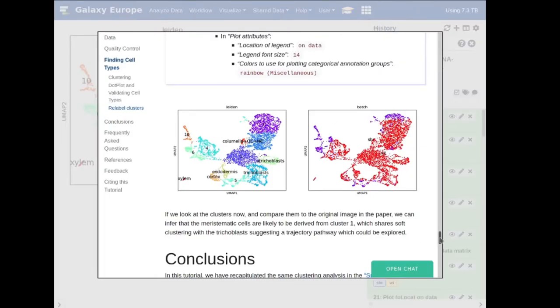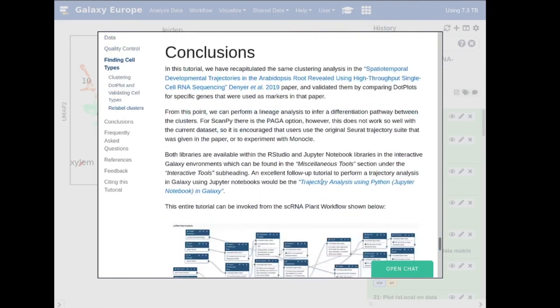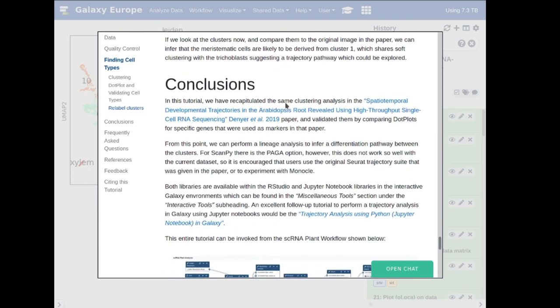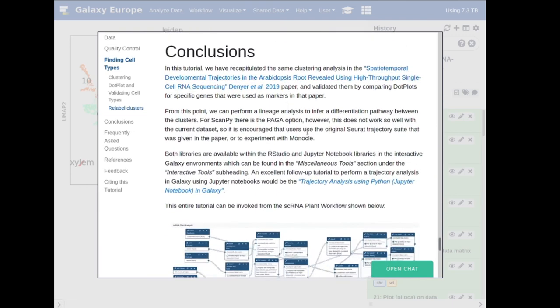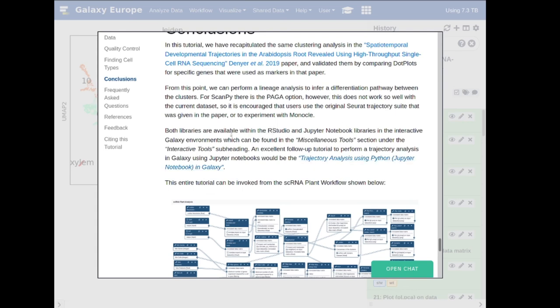From this we can possibly infer a kind of differentiation from this central cluster. Looking back at the original clustering in the paper, cluster one is quite likely to be the meristemic cell type which then differentiates into the trichoblast trajectory pathway. This is as far as the original paper went in terms of determining the clusters, but we can take it further and perform an actual trajectory analysis using the same dataset in a different tutorial. I leave this as an exercise for keen users who wish to try using the excellent single cell materials in the R Studio and Jupyter Notebook libraries.